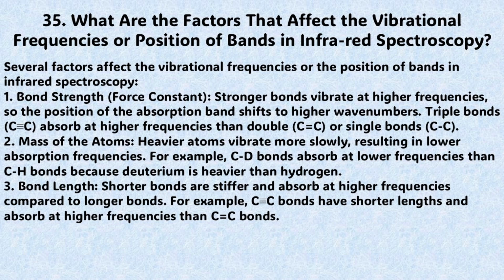Bond strength, force constant. Stronger bonds vibrate at higher frequencies, so the position of the absorption band shifts to higher wave numbers. Triple bonds, C≡C, absorb at higher frequencies than double, C=C, or single bonds, C-C.